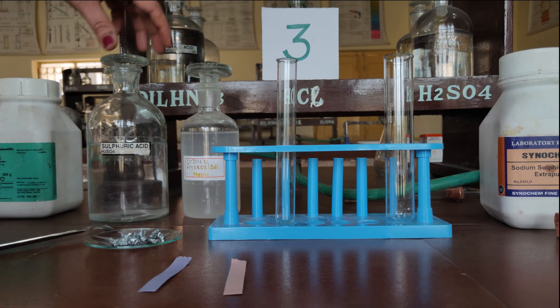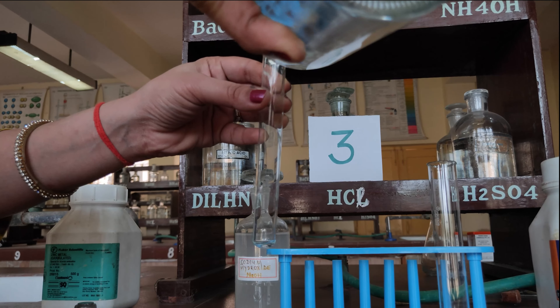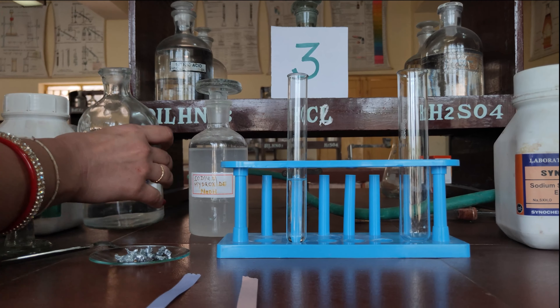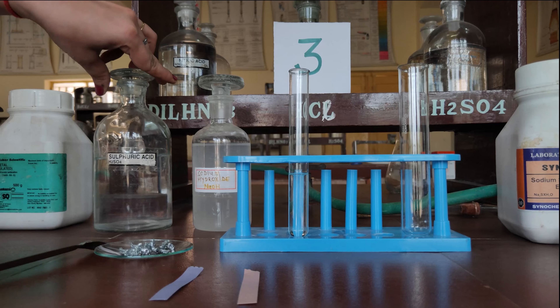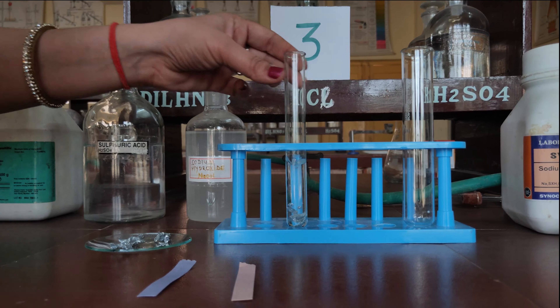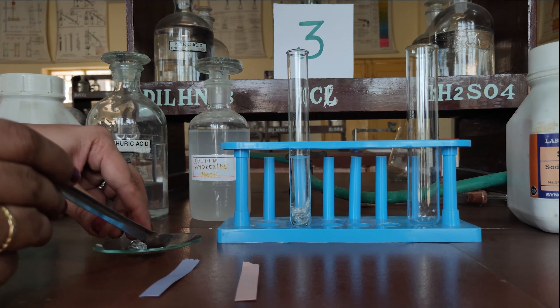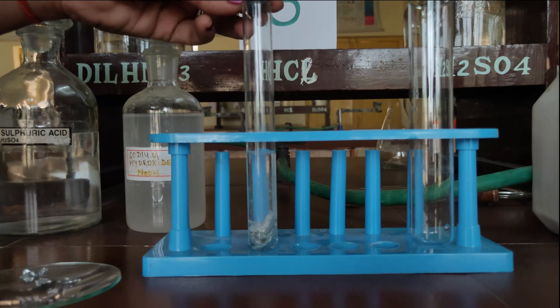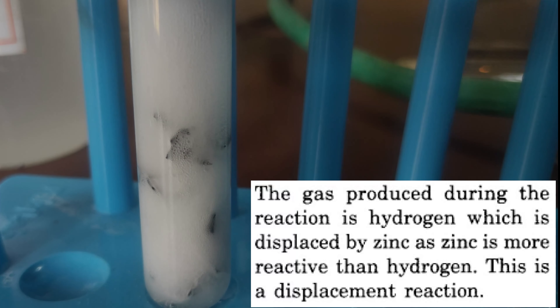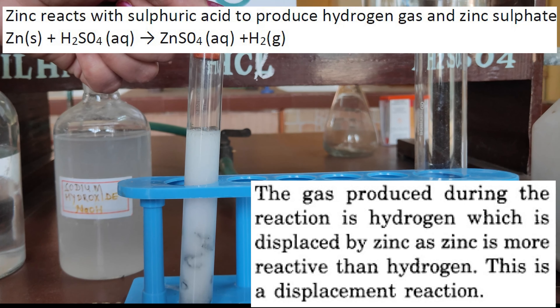Procedure: In a clean test tube, pour some dilute sulphuric acid. Using a spatula, add some zinc granules into the sulphuric acid. A brisk reaction occurs and gas bubbles evolve. This hydrogen gas is produced because hydrogen is displaced by zinc, as zinc is more reactive than hydrogen. This is a displacement reaction.